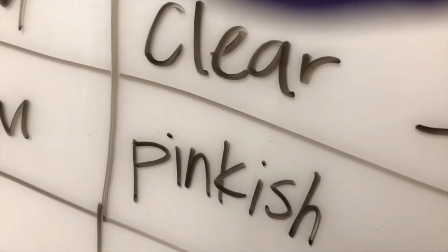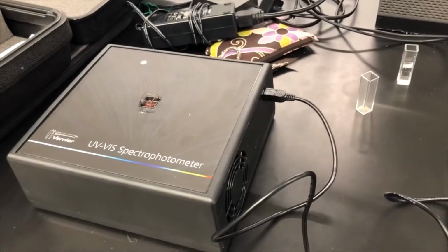It was 501.2, and it had an absorbance of 0.392. So that spectra was taken at 1:10. Now I'm going to wait just 2 minutes. So at 1:12, I'm going to take it again, and I will start recording then.